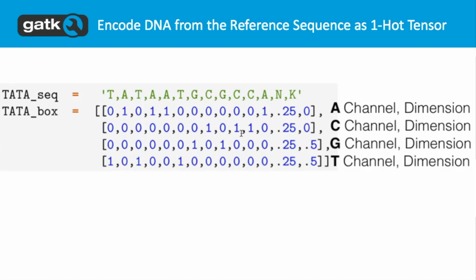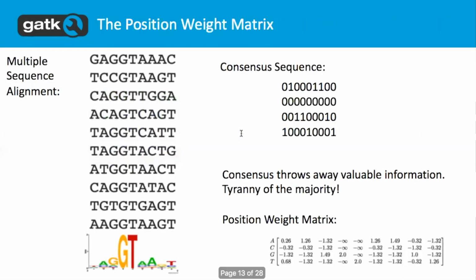As we progress towards deeper layers, they look at more and more complicated features. So the idea basically is that we're trying to do the same thing with the reference. You want to start by looking at the very simple features, and as we get deeper and deeper in the neural network, we'll get more complicated features out. And I'll show you examples of those features.